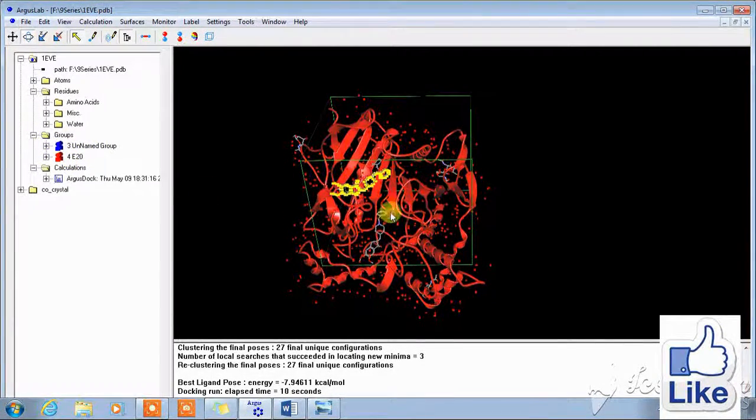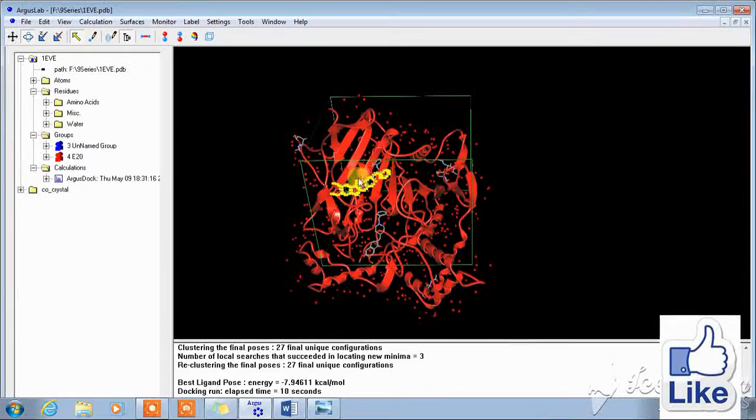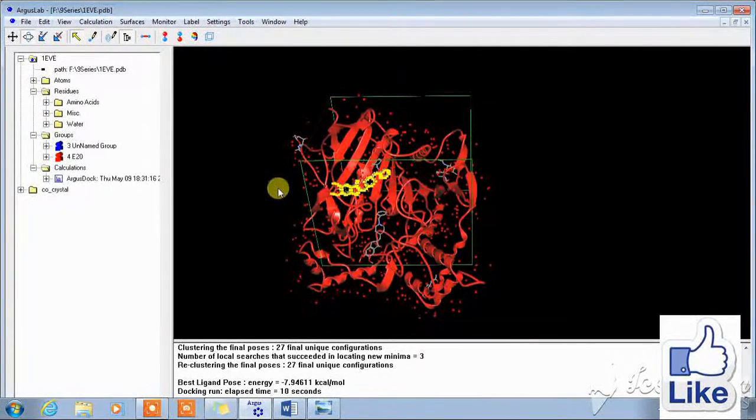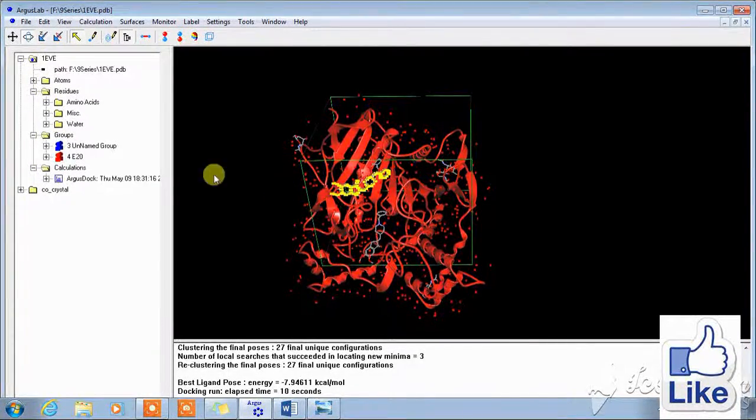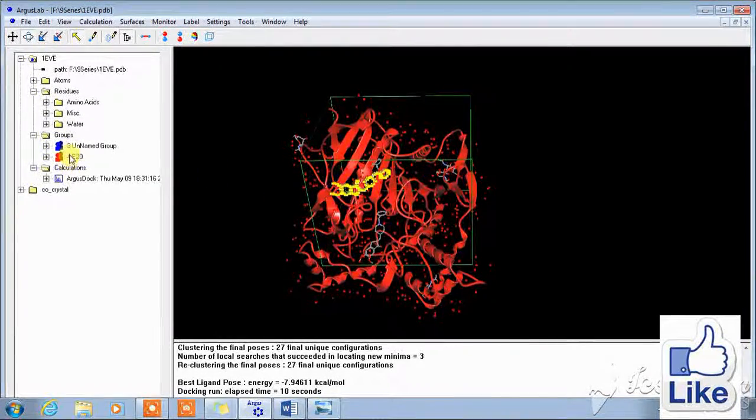Now this compound you can take any view also.